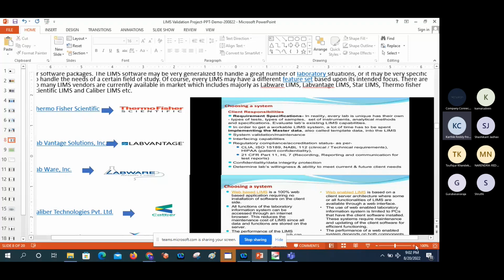Under manufacturing, they have all raw materials, in-process materials, finished goods, packing materials, and so on. For example, APIs, reagents, solvents; this kind of data I need to evaluate. Like how many specifications there are, how many STPs, how many stocks, how many instruments, how many inventories, how much stability data, how much environment monitoring data, how much media management like culture, and microbiology inventory. I need to assess all types of master data.